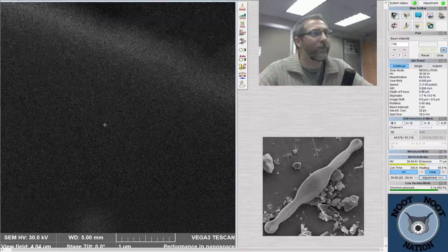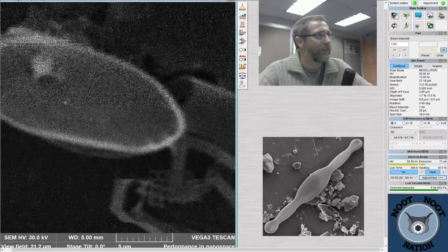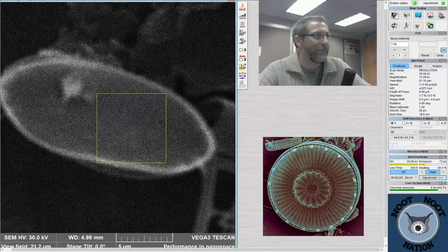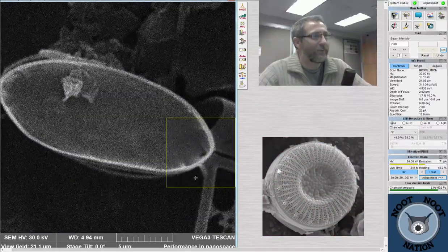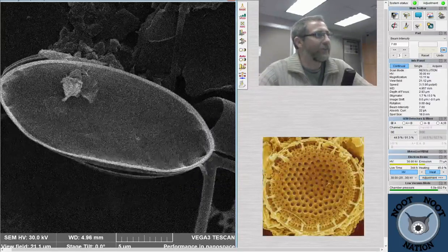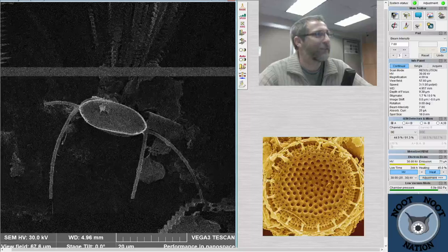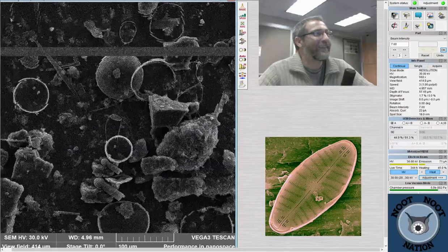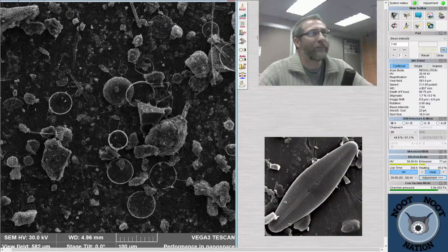It's always a little terrifying when I move the stage up, because it's driven by a motor, and the motor thinks it knows what the distance between the stage and my pole piece is, which is where the electron beam comes out, but it's possible that it could get confused, and if it does, it will destroy the entire instrument by ramming the stage up into the pole piece while it's running. You don't want it to happen when it's not running either, but especially when it's running, it's bad. So I'm always super focused on what's happening over there when I'm moving the stage upward.